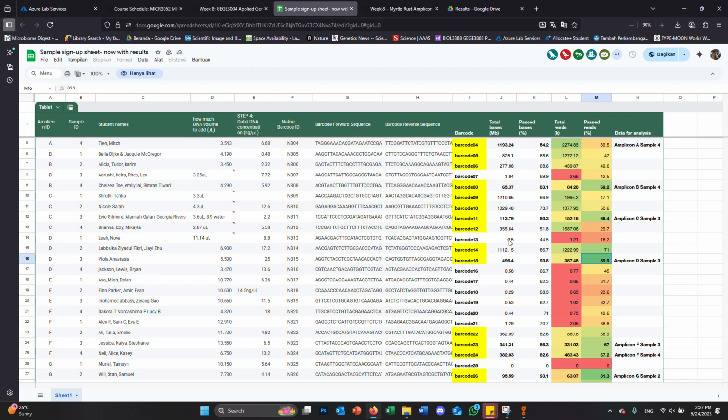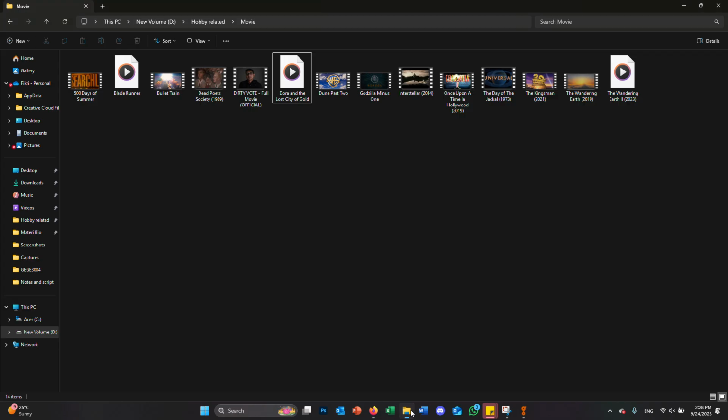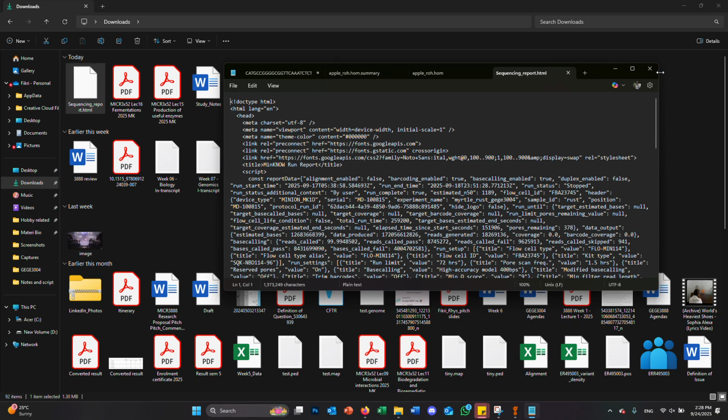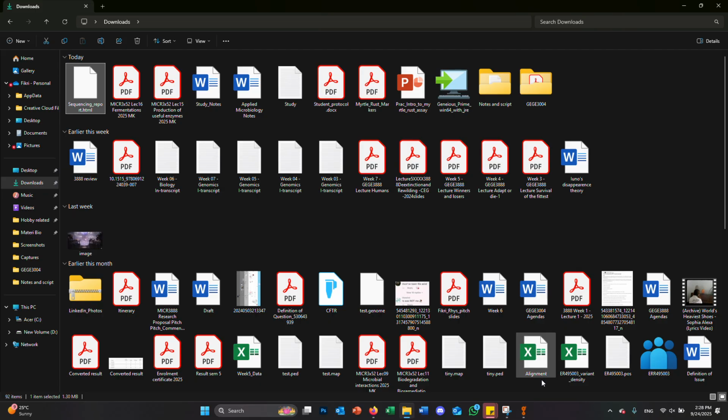So that's our comparison. We get really variable Phred scores with Nanopore data, suggesting that the quality is highly variable across the reads. Our read length is huge compared to our Illumina data. Phred scores are consistently high, and our read lengths are all the same. Okay, so they're the two sort of things that you can gain from that plot. There's lots of other things we could work through in the FastQC file. Can't teach you all of them today. Probably something that you would get into if you were doing an honours project in next-gen sequencing, something that you would get to work through in your project.